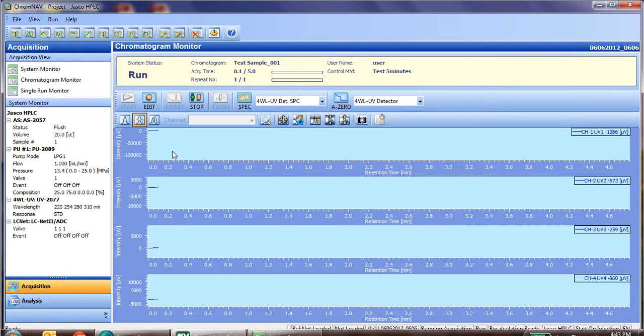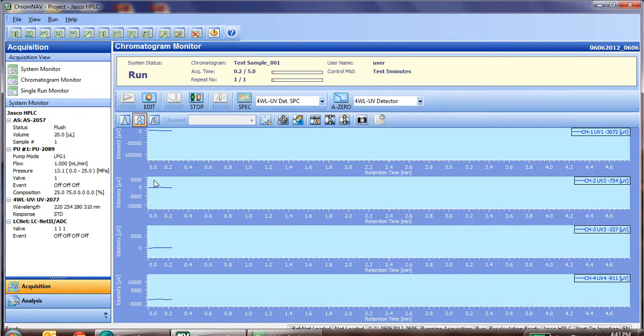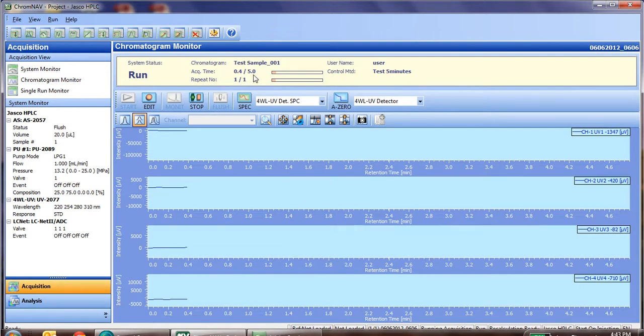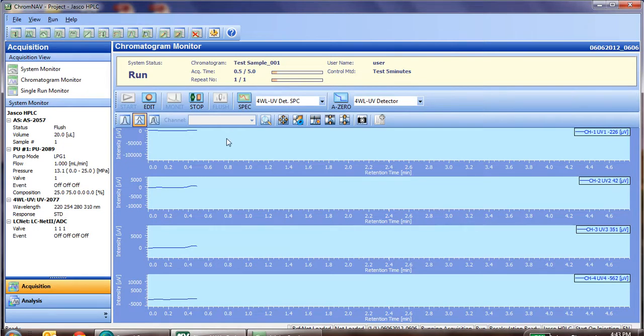Now, as you can see, the autosampler has injected the sample. As shown in the methods, the detector channels have all auto-zeroed, and you can see the acquisition time shows 0.3 minutes of 5-minute total. Now we'll continue to watch as the peaks should start to elute.